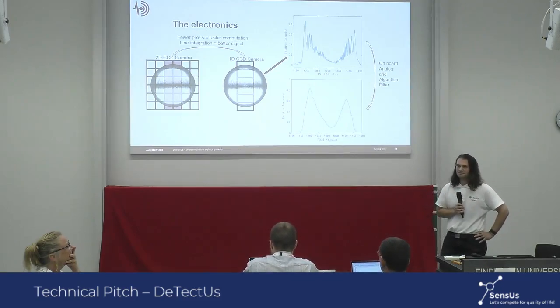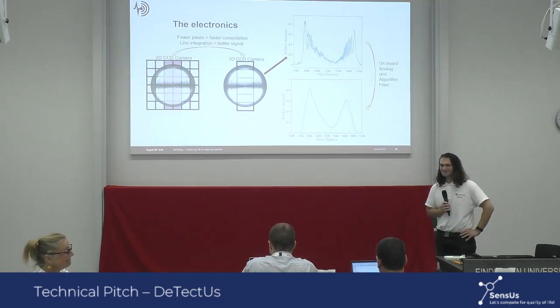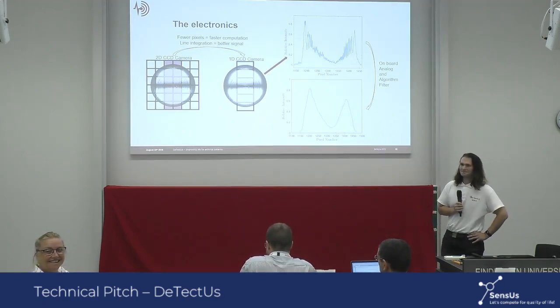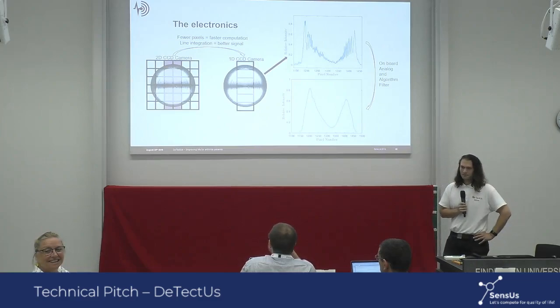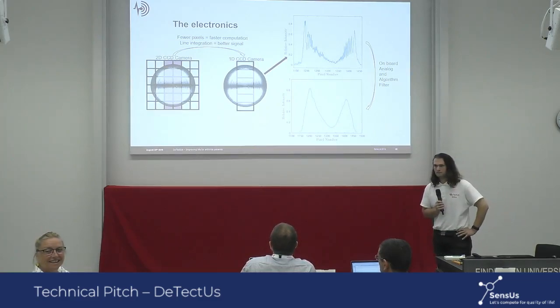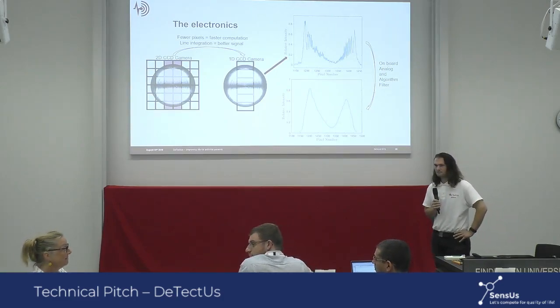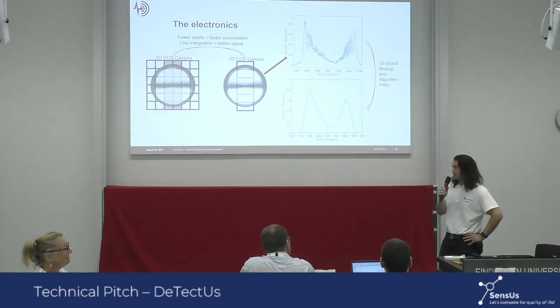Okay, I also appreciate the effort you did to build an SPR instrument. There are also many on the market, and it's good that you have an approach which is much cheaper. But for the target for sensors here, you want to put it on a point of care. So is there potential to miniaturize, or how large is it? Can it be smaller?